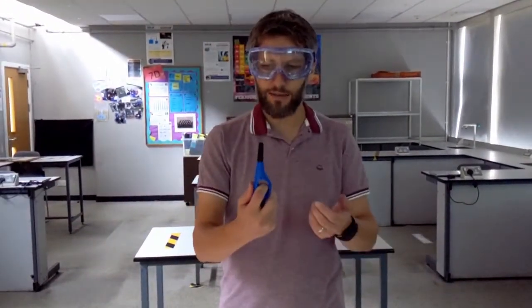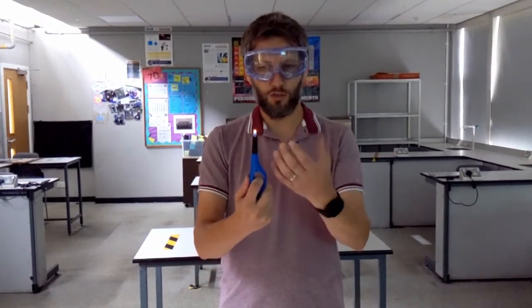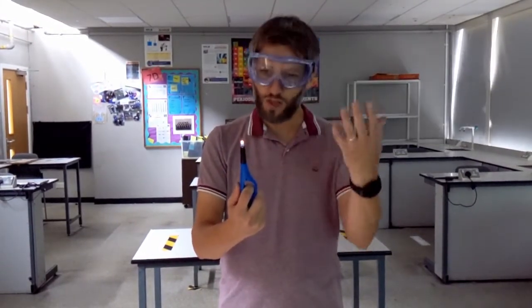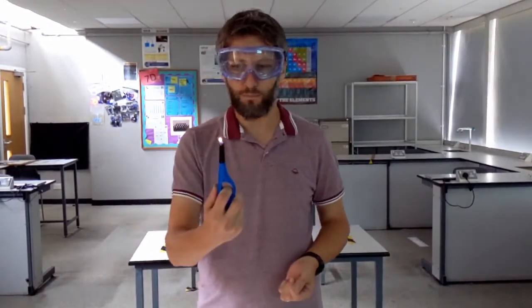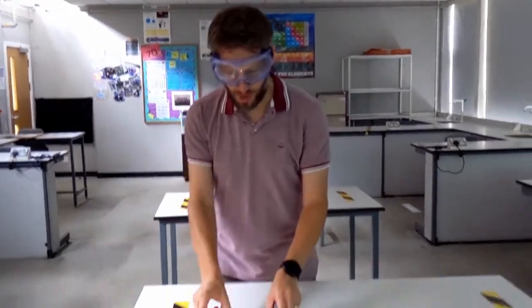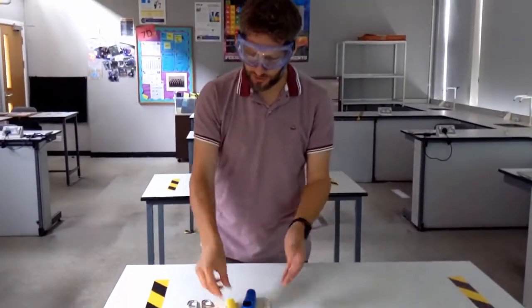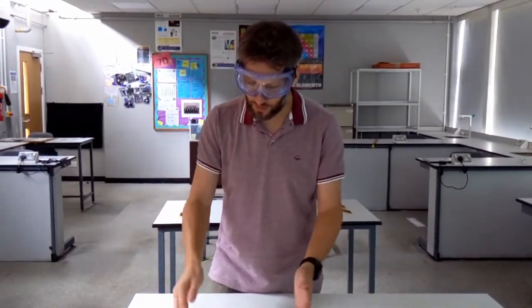Another example is a lighter you might have in the kitchen, or if you're going camping. Again, if we can get that to light, we've just got a fuel in here that's burning and reacting with oxygen in the air to create carbon dioxide and water. Now, as we said, different fuels burn in different ways, and some are much more vigorous. And what we can do is take that vigorous burning and see what other effects it can cause.